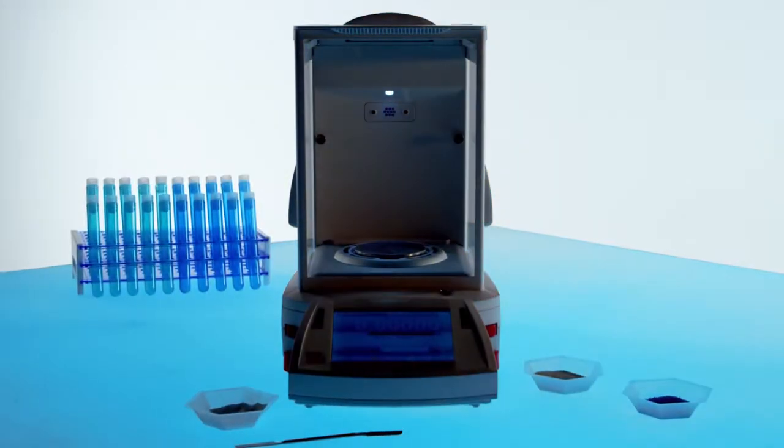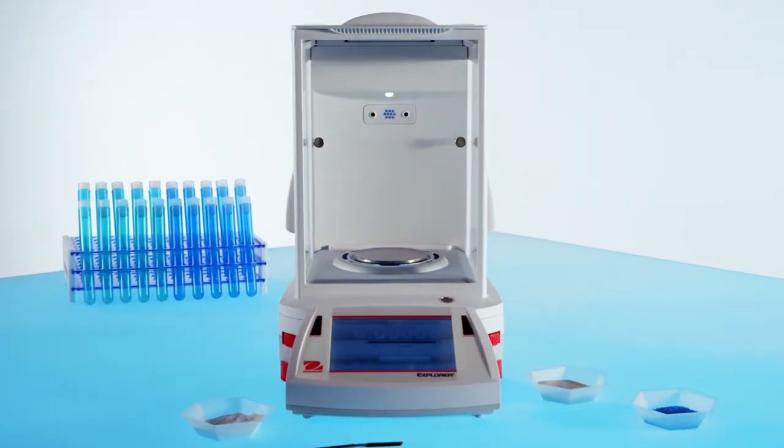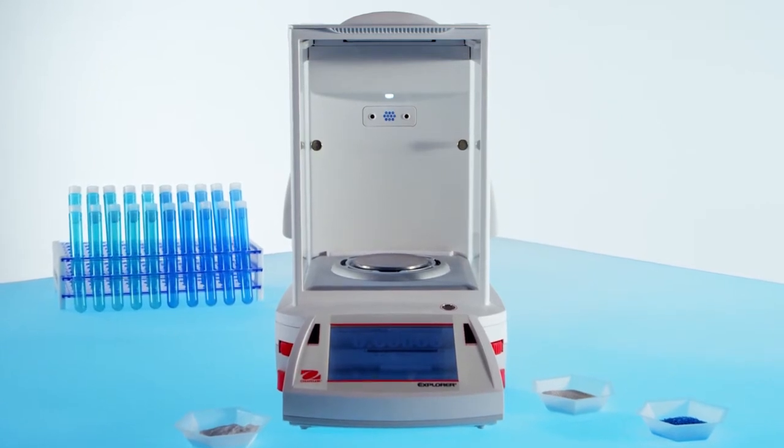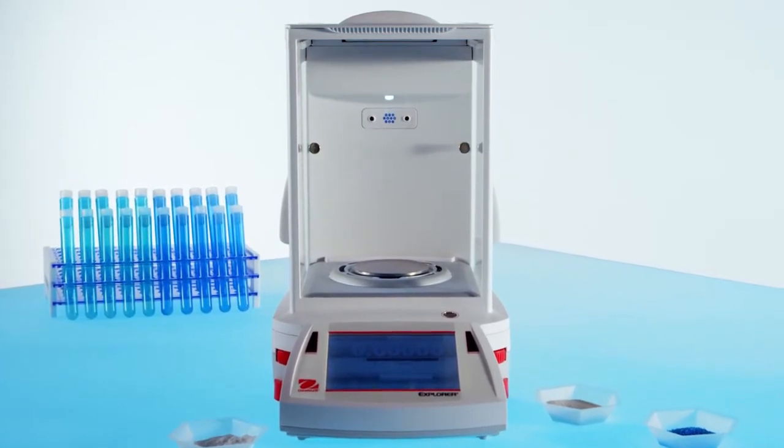Introducing O-House Explorer, intelligent performance, ingenious construction, intuitive software.